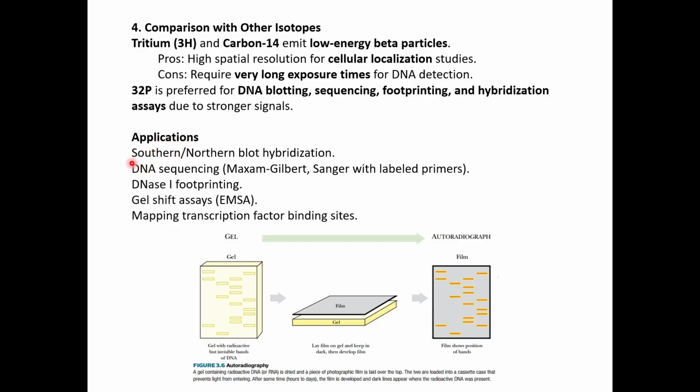Then your basic applications are in Southern and Northern blot hybridization. You could use it for DNA sequencing, Maxam-Gilbert, Sanger, labeled with primers. Then DNA footprinting, then gel shift assays, mapping transcription factor binding sites, etc.